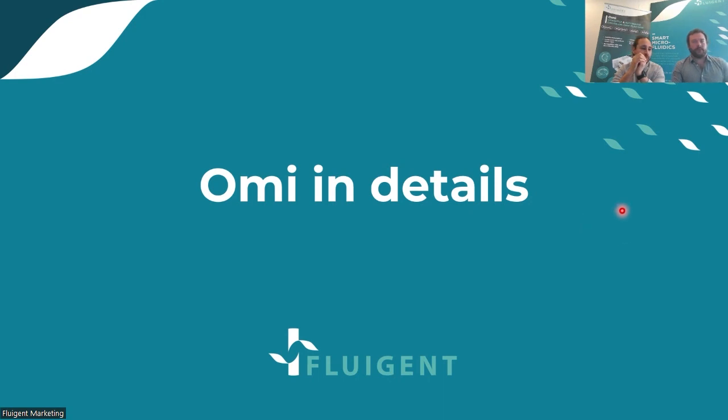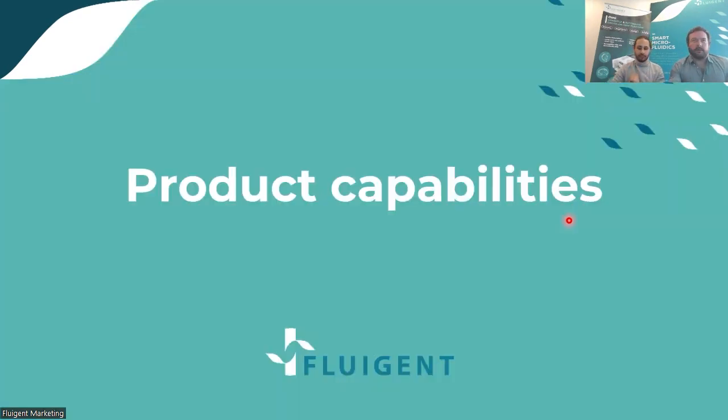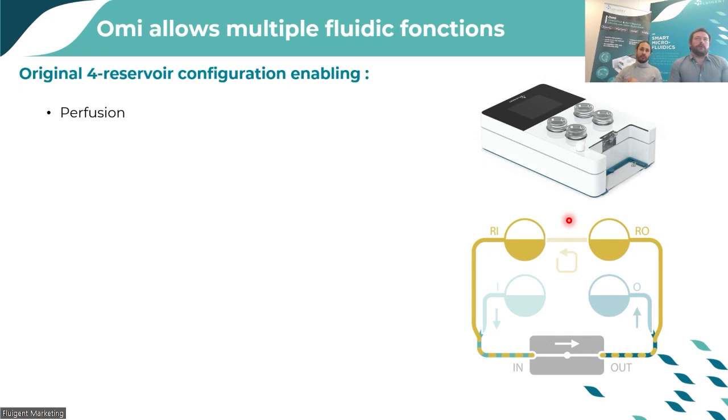So I will start with just the basic capabilities of OMI. When you look at OMI, the first thing you can notice is that there are 4 features here that are actually reservoirs. So when you look at the fluidic configuration, you can depict the fluidic layout as follows.